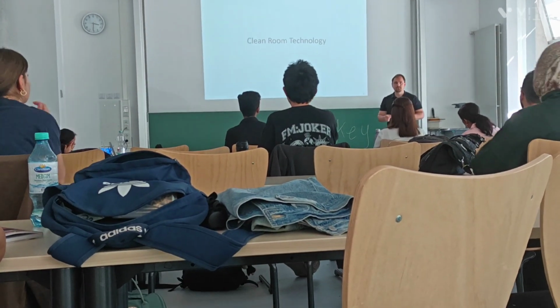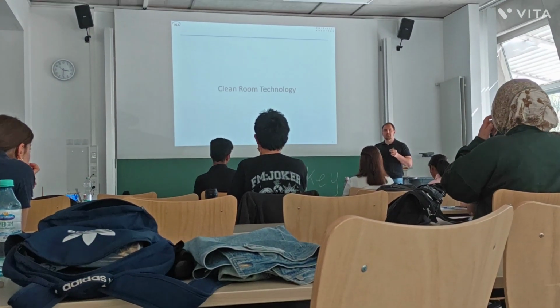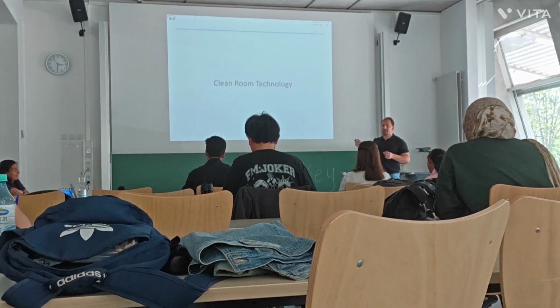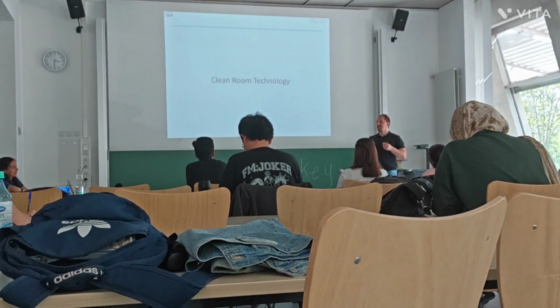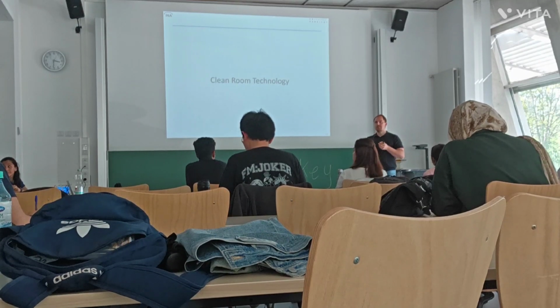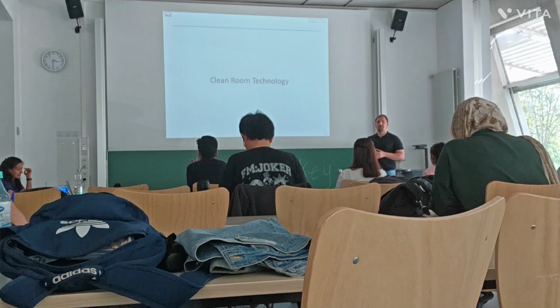Called the clean room. And as she already mentioned, we work in the clean room because we use special conditions. As the name clean room suggests, we want to work in a clean environment, and the biggest thing of this is the clean air. So we have air which we want to have free of any particles which will contribute to our sample.